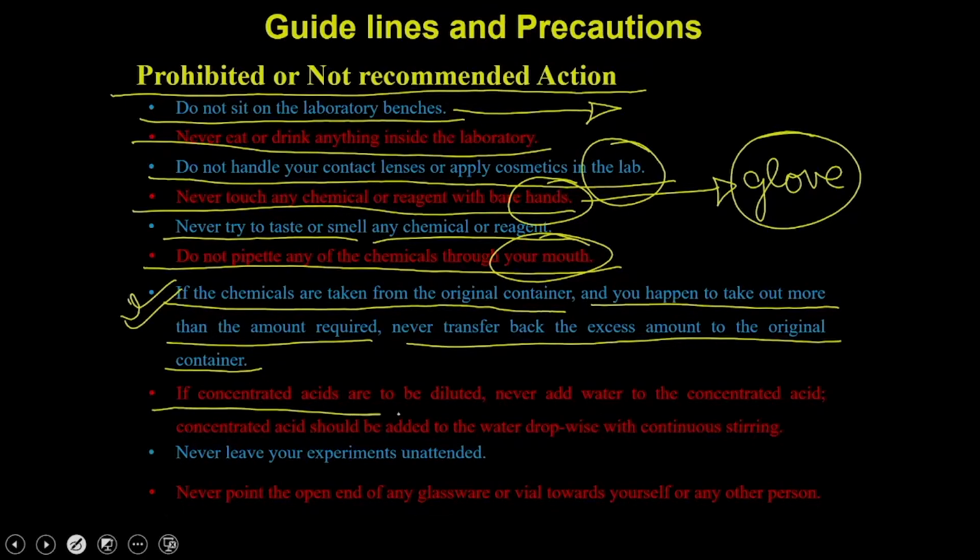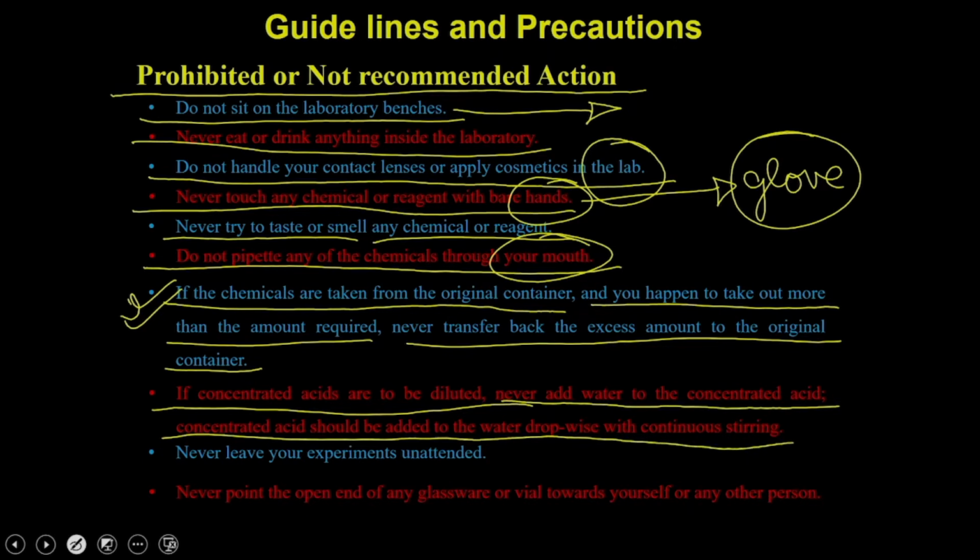If concentrated acid is to be diluted, never add water to the concentrated acid. Concentrated acid should be added to the water drop wise. This is very important, and anyway we are going to discuss it in detail when we discuss how to prepare the solutions.